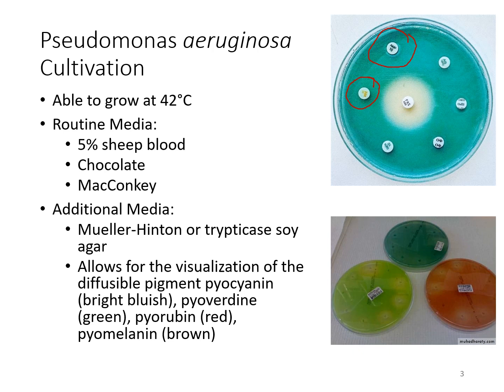If it were plated on the Mueller-Hinton plate, then you could start seeing some of these characteristics from that diffusible pigment. So you get those different shades of color, and here's that blue color that I was talking about earlier, the green color, and sometimes it gets a little fluorescent look to it, the red color, and of course there is a browner pigment that makes a brownish-dark color to that agar. Couldn't find a good picture of that.